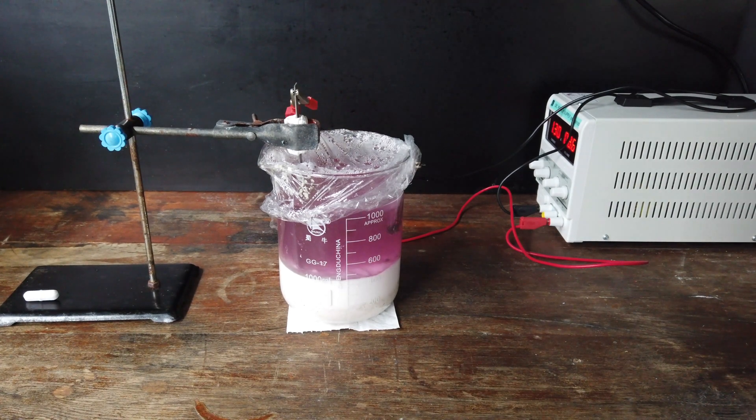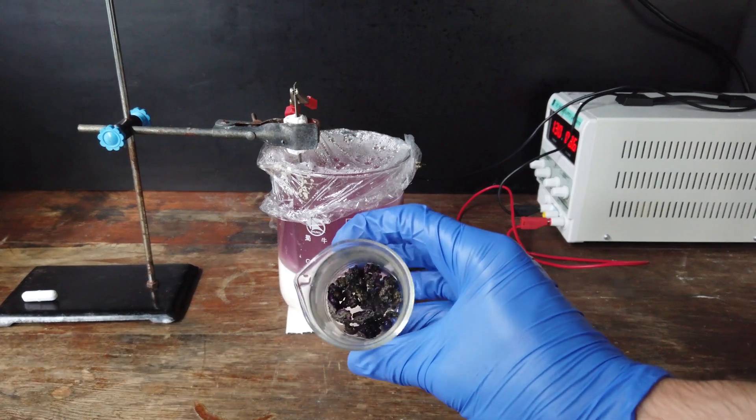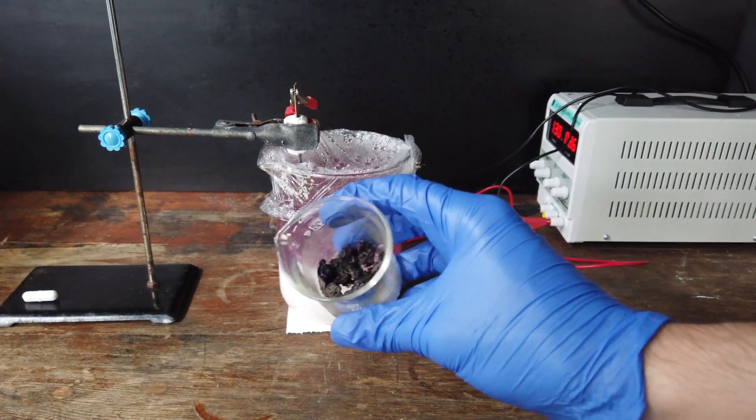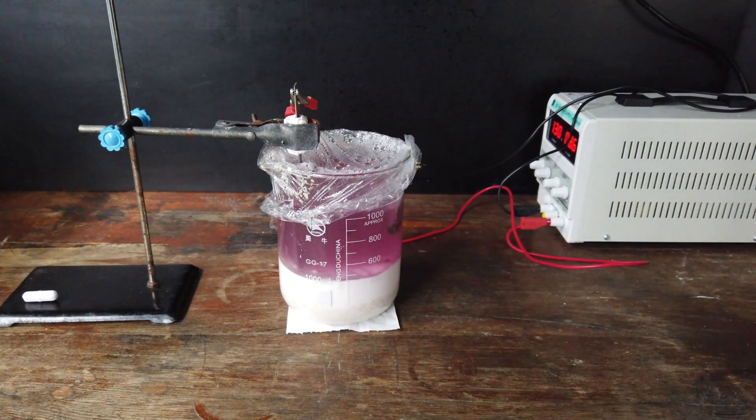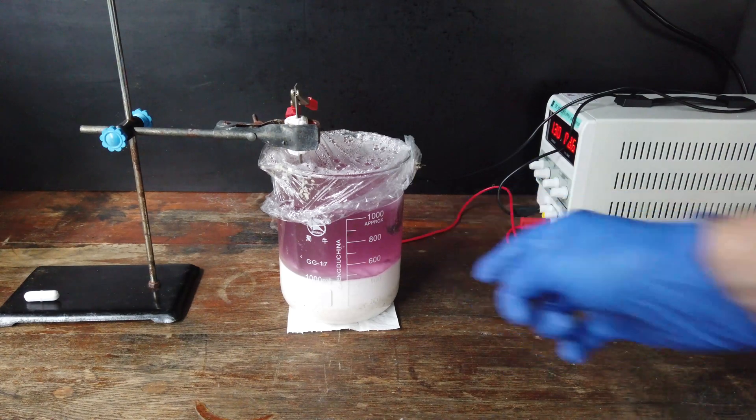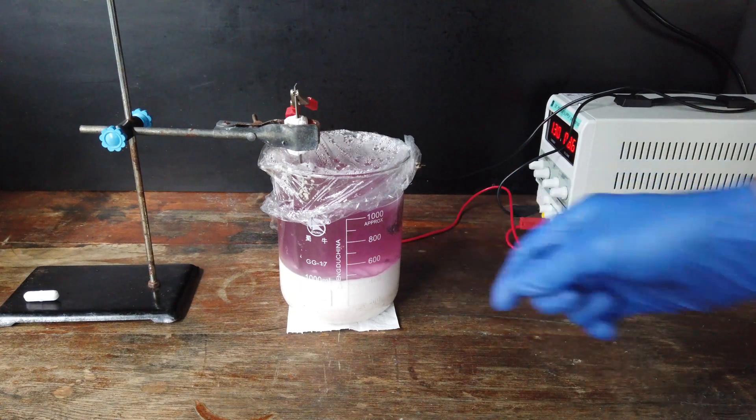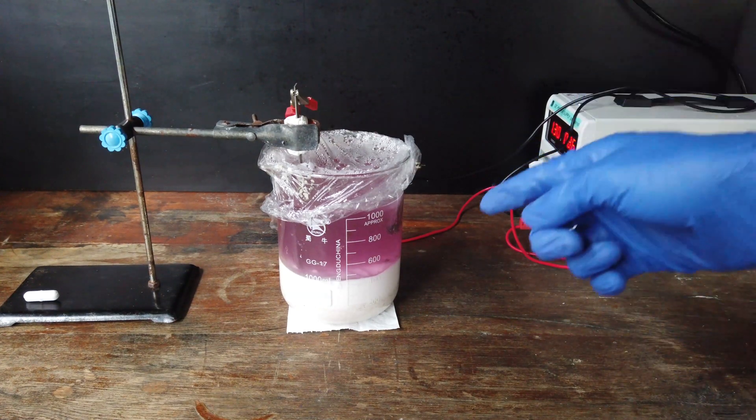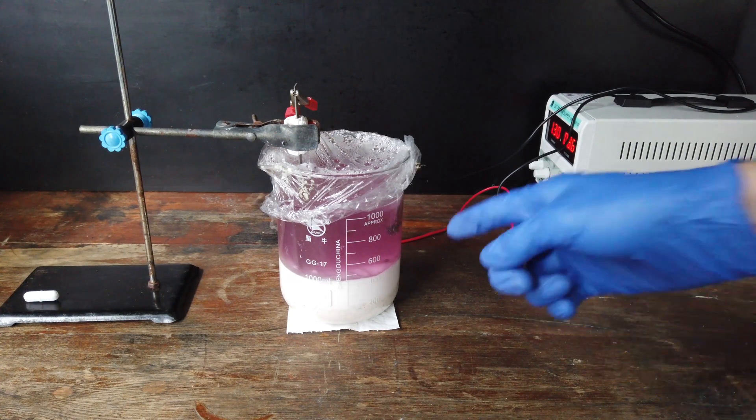Two weeks on from starting our electrolysis, you can see we have made a reasonable quantity of our cobalt and nickel mixture. This is everything I've harvested off the cathode from our cell, and we've had it running at about one and a half amps this whole time. As I said earlier in the video, I've been periodically stirring up the mixture.